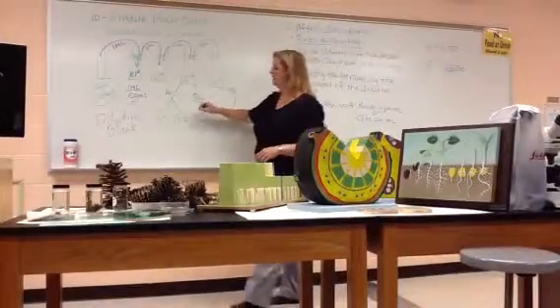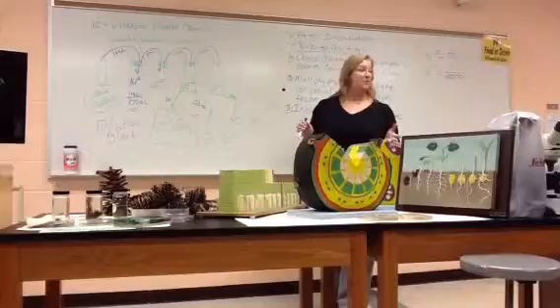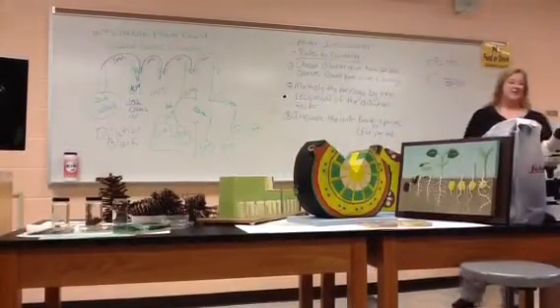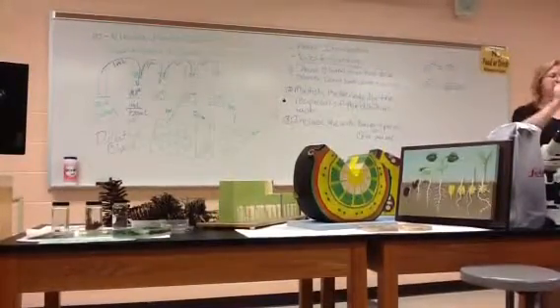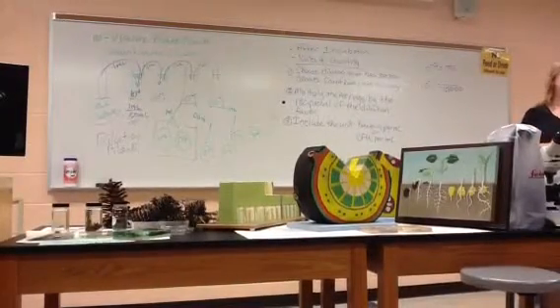Just say that you chose, for the sake of argument, 10 to the minus 6, right? Just so we can do an example. Then you actually have to count them. Yes, every little dot on that petri dish. A lot of people take a fine magic marker and make a dot on each colony as they're counting them, so they know how many they've counted.